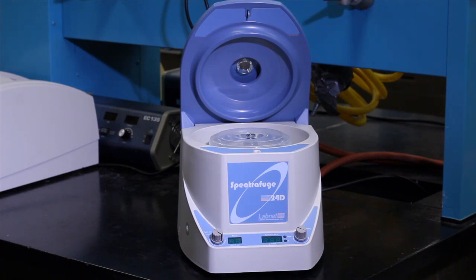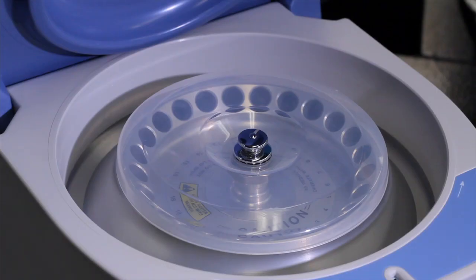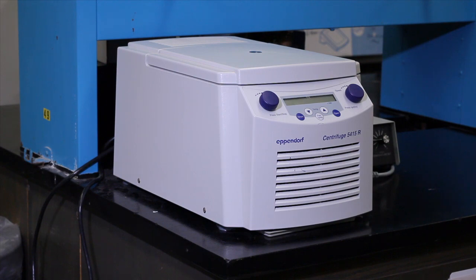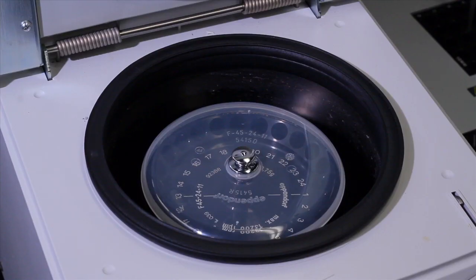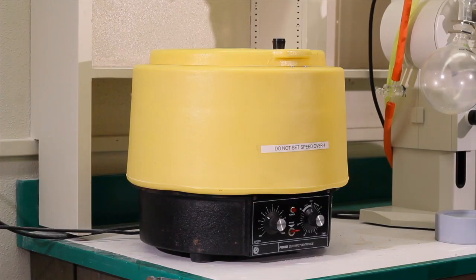Centrifugation is a process that utilizes centrifugal force to cause the sedimentation of suspended particles. Thus particles with greater density sediment first followed by less dense particles.